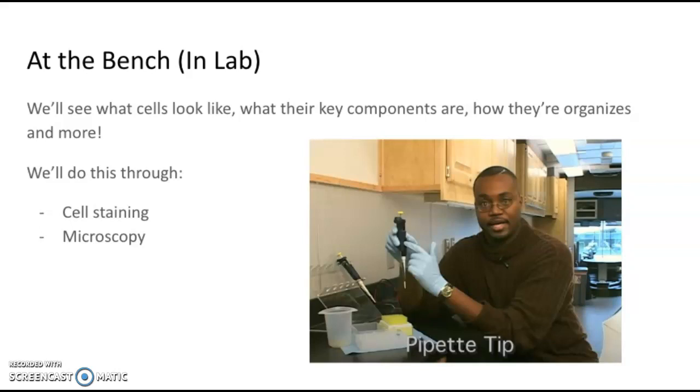The other thing I'm going to have you do this week is you're going to have to collect some cells, right, from you as one source. And you're also going to have to stain them. And we're not going to need a ton of liquid to do that. So we're going to start using something called a micropipette. And this gentleman right here, I'm linking the video to this page. I want you to check this out because he's going to give you some micropipette tips.